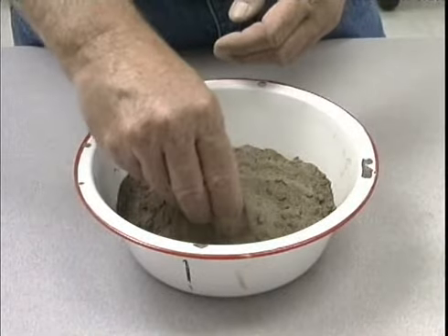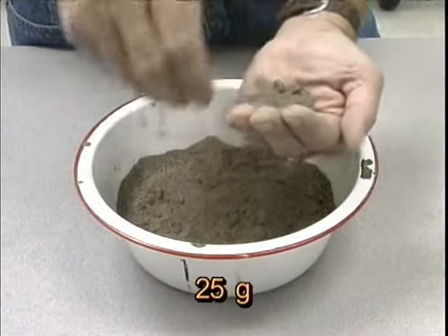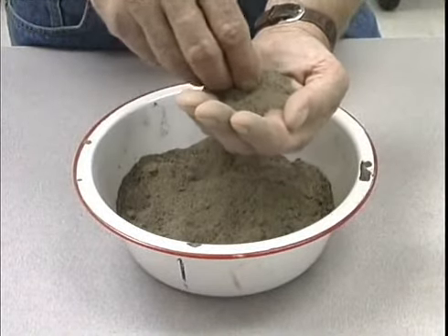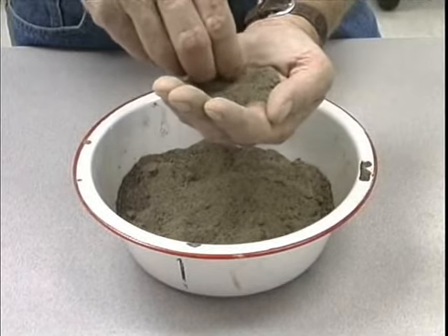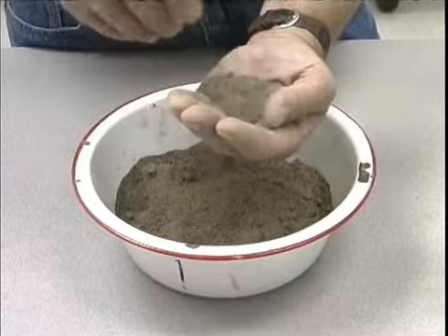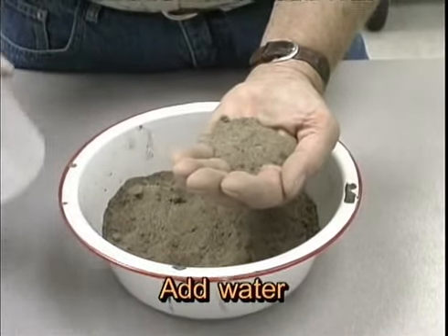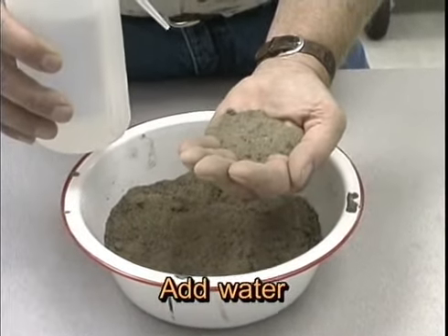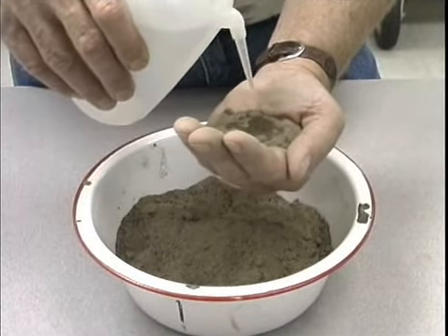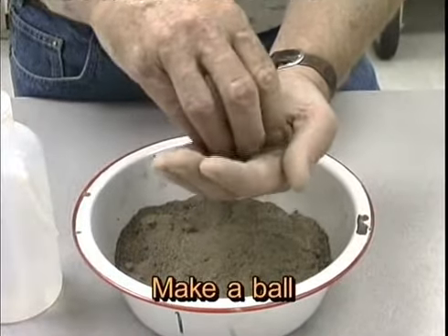To determine soil texture by feel, I take approximately 25 grams. How much is 25 grams? 25 grams is about enough soil to fill the palm of your hand. I remove small aggregates by crushing them. Then I begin to wet this soil. A small dropper bottle or water bottle such as I'm showing you here works well for this. What I'm trying to do is bring this soil up to the right moisture content to make a ball out of this quantity of soil.